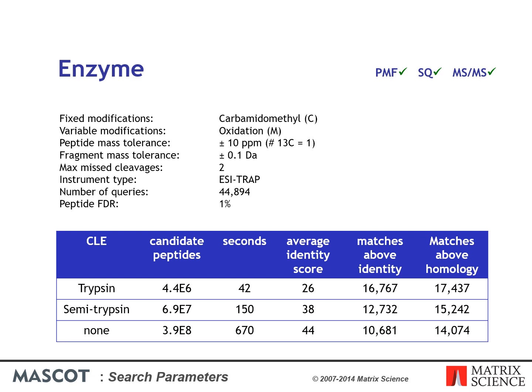So doing a no-enzyme search in Mascot is not a good idea unless there is a very high level of non-specific peptides. Semitrypsin will be a better choice if the peptides came from a tryptic digest, but there is a high level of non-specific cleavage. Only use no-enzyme if the peptides are not the products of an enzyme digest, e.g. MHC peptides or endogenous peptides.